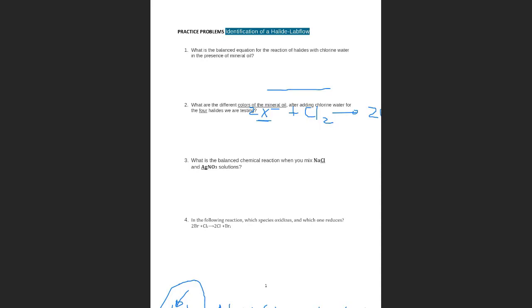Let's say silver forms with ammonia this complex and dissolves the precipitate. If you start with this precipitate and you add drops of ammonia to dissolve it, you might need 15 drops.